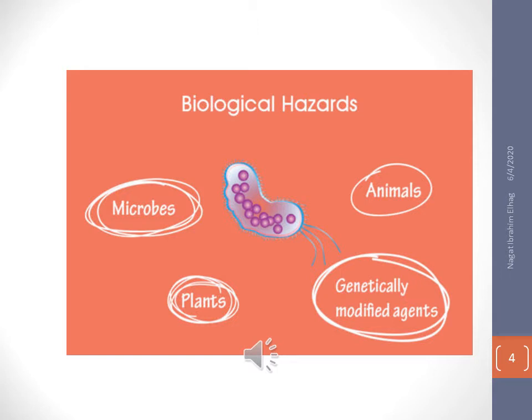And microbes are a source of biological hazards, such as viruses, bacteria, and parasites. So we have to be careful when handling samples containing these infectious diseases by using cabinets, because as I mentioned before, cabinets are very suitable in microbiological labs because they keep the contaminated area very small.